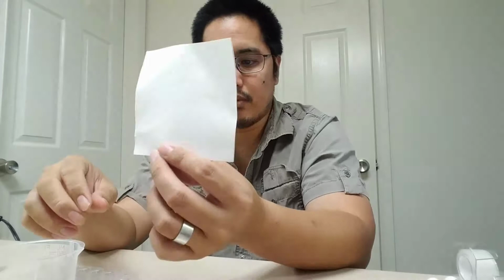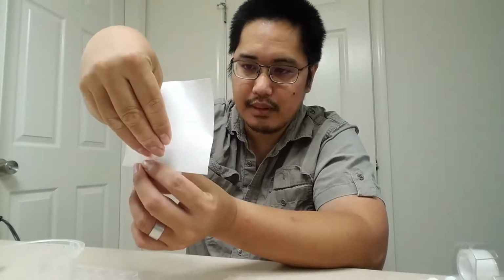You start off with paper, and what's going to happen is we're going to put this in water, and the water is a homogeneous mixture. So what happens is the water will go up the paper through capillary action. And a homogeneous mixture is a mixture of two or more substances. And so as the solution passes through the paper, the solutes separate due to their interaction with the paper.